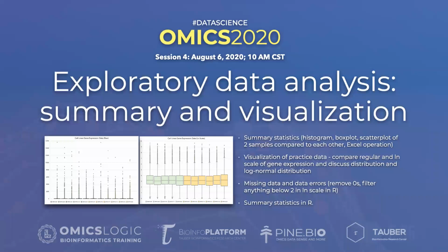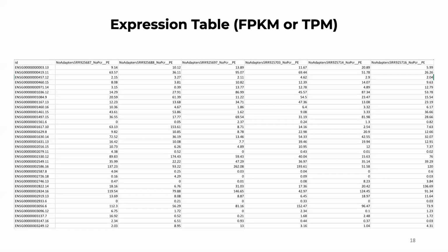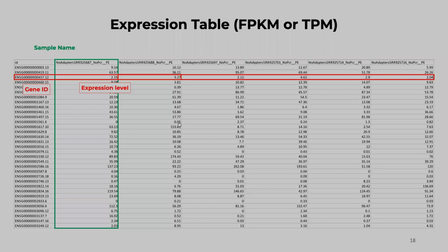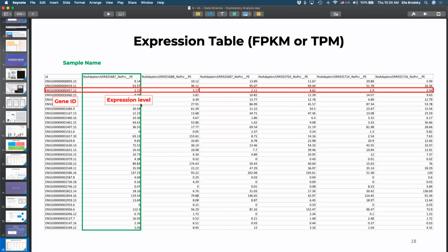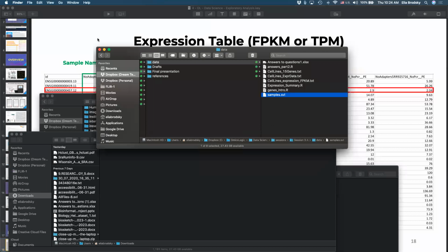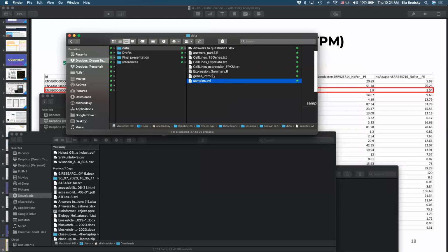Okay, so what are we going to be dealing with? This is a data set that is so-called raw data, right? So this is direct output from that pipeline in FPKM or TPM. So again, we have sample name and we have gene ID, and here we have expression level. Now, let's take a look at this file. This file is, again, in the same link that you got yesterday from BIPSA. So you can go back and open that folder, and inside there are a number of files.